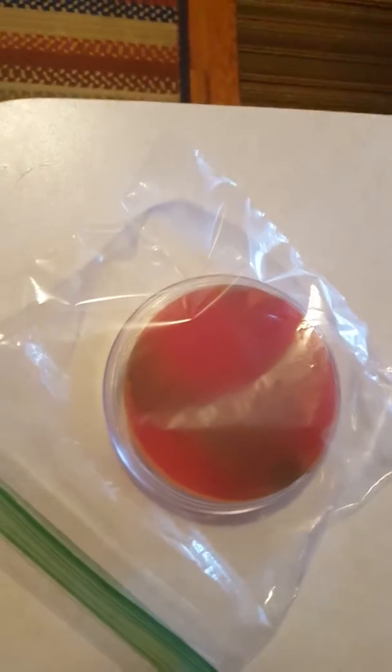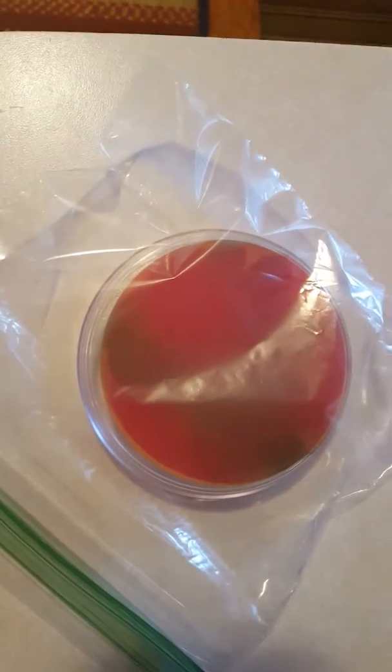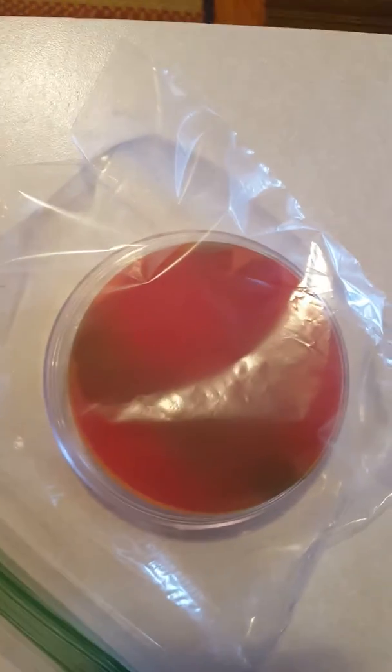Here's the third part of my video on how to isolate bacteria. I put the petri dish in a plastic bag to conserve moisture. I don't have an incubator at home, so I just put it above my fridge — it's a warm place.